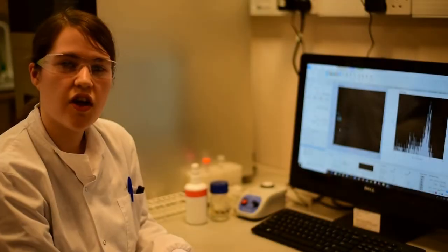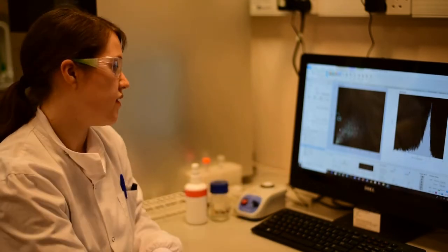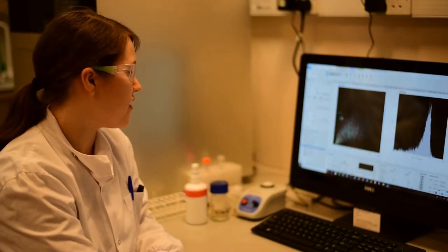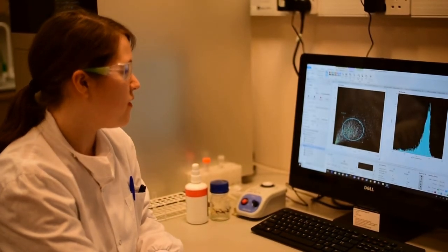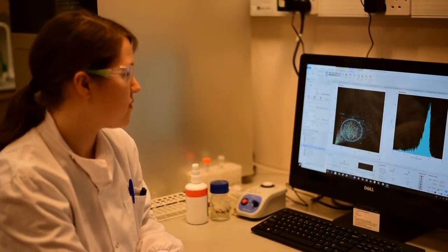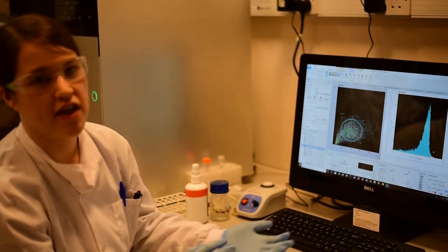That's fascinating. So can you show us that in action? Sure. So in this plot here, you can see the size of the different cells. When I select the size of the cells I'm interested in, the software focuses in on this population. Over here, you can see the intensity of the cells in the blue channel.